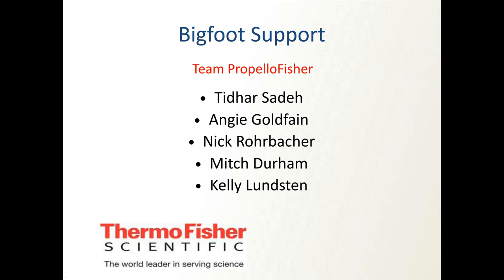Thank you, Alan. Our next question here is, since you used both beads and cells for the single color controls, did you find an advantage with one or the other? Oh yeah, another great question. And the answer is yes, with an asterisk next to it.